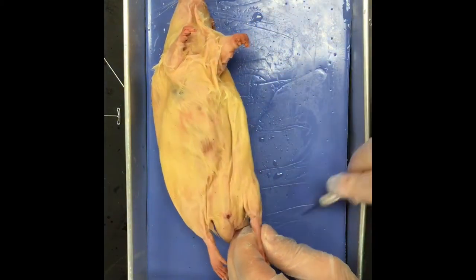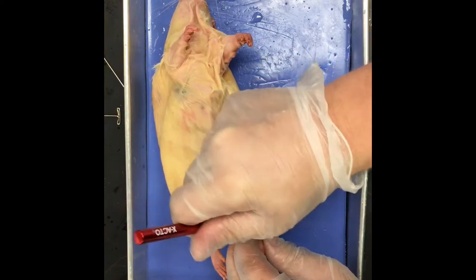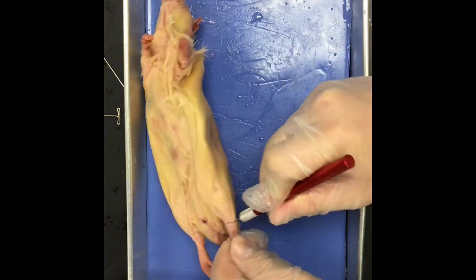You're not gonna see any blood here. If you see anything red or blue, that is latex. Blue latex is gonna be for veins. Red latex is going to be for arteries.